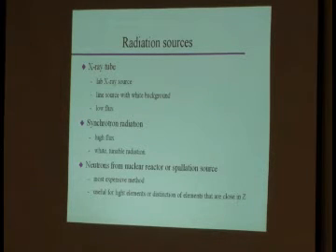So, let's look at the different parts of our experimental setup, and let's start with the first one, radiation sources. Here are the 3 most commonly used radiation sources. The most commonly used one is the X-ray tube, because that is your lab X-ray source, and most people do their experiments in their lab. This is a so-called line source with a white background. We'll see a couple of slides down what exactly that means.